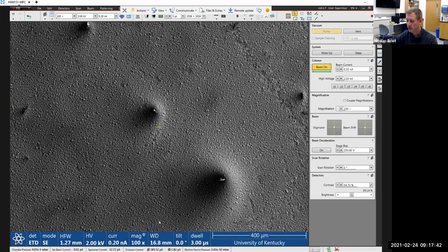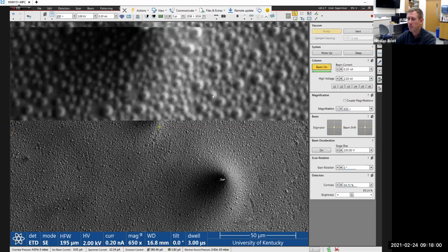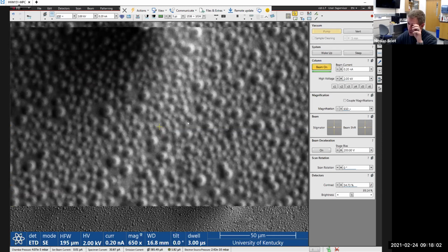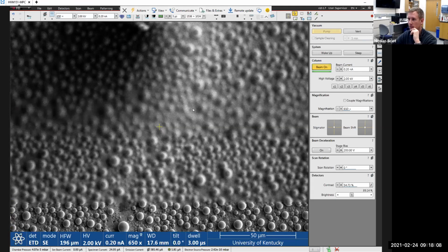If I turn the magnification knob that I have in front of me, it's just going to tell the machine to only scan them from here to here, for example, and this is going to become my new field of view, and that makes it more magnified. So I'm going to do that right now, just turning the button, and that's it. You can tell that my focus is not so good, so I'm just going to turn the focus knob again and try to get something a little better. And here we go.